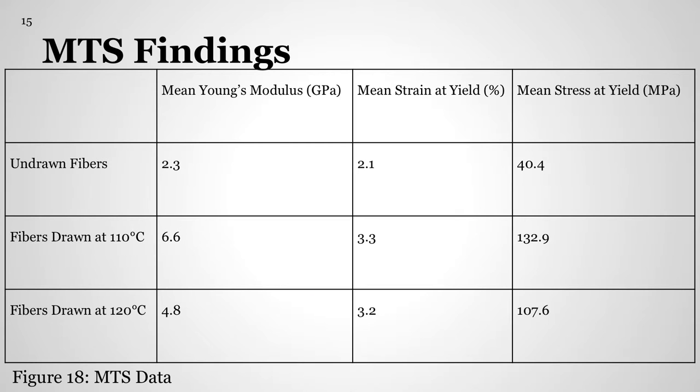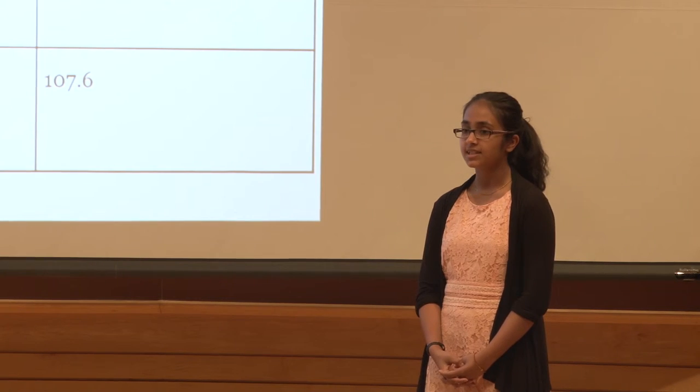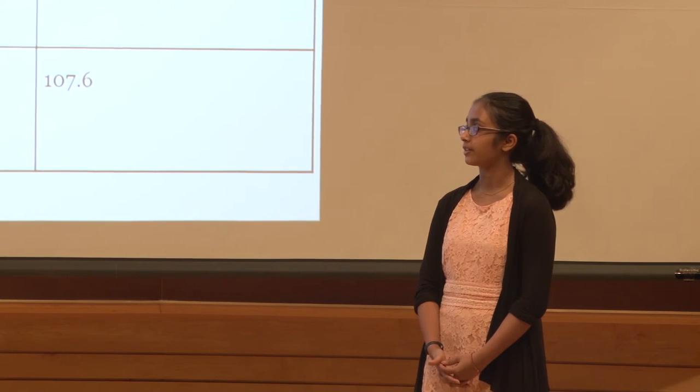So, as you can see, these are the MTS findings. We tested for the mean Young's modulus, mean strain at yield, and mean stress at yield for undrawn fibers and fibers drawn at 110 and 120 degrees Celsius. The drawn fibers had higher values for all three tests than undrawn fibers, so this means that they were more resistant to deformation and had higher tensile strength.